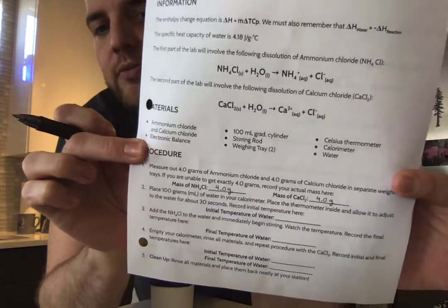All right, so it says we're going to measure out 4 grams of ammonium chloride and 4 grams of calcium chloride. Yeah, totally did that. It's right here off screen. You can't see it, okay? So it says mass of NH4Cl. I'm going to record 4.0 grams because I'm perfect and I didn't make a mistake. So I've recorded 4.0 grams for both of those, okay?